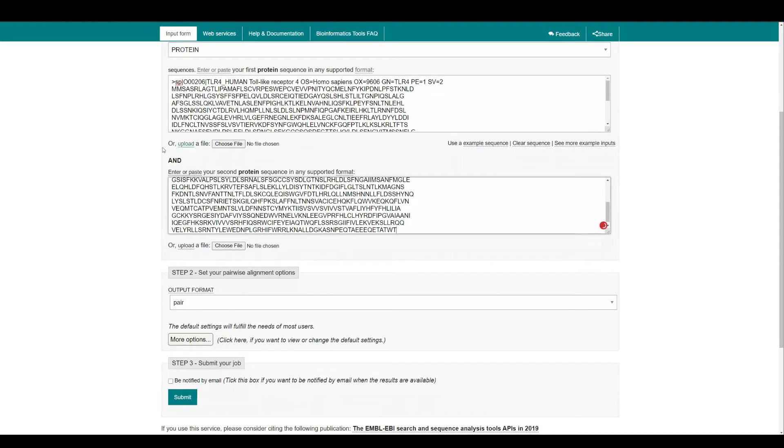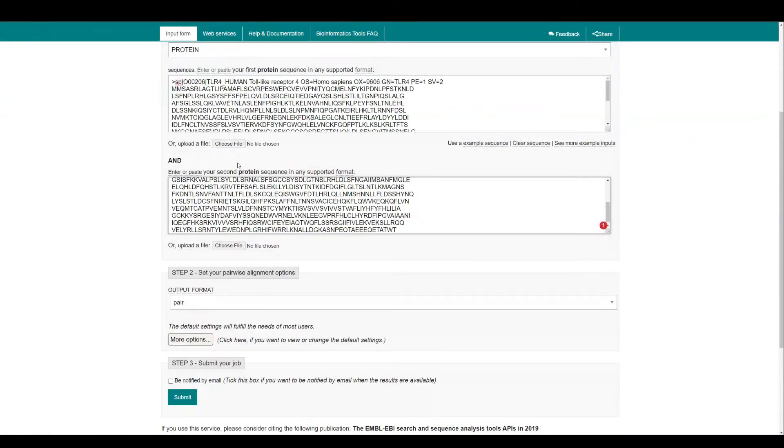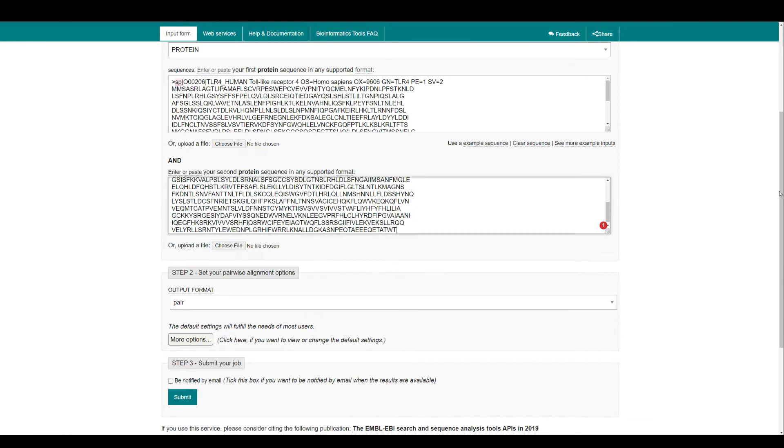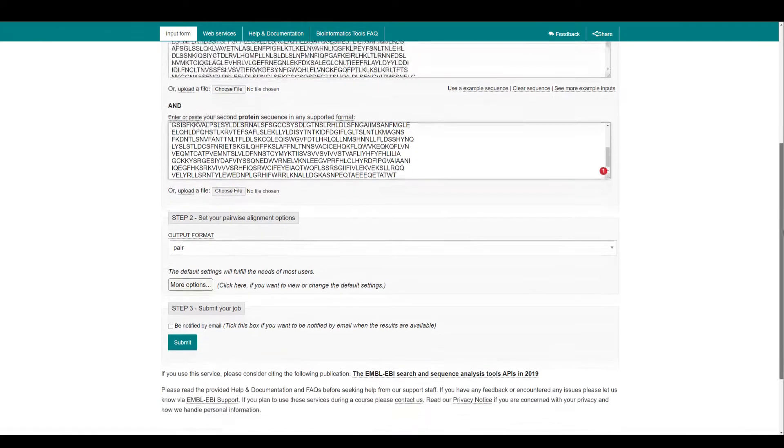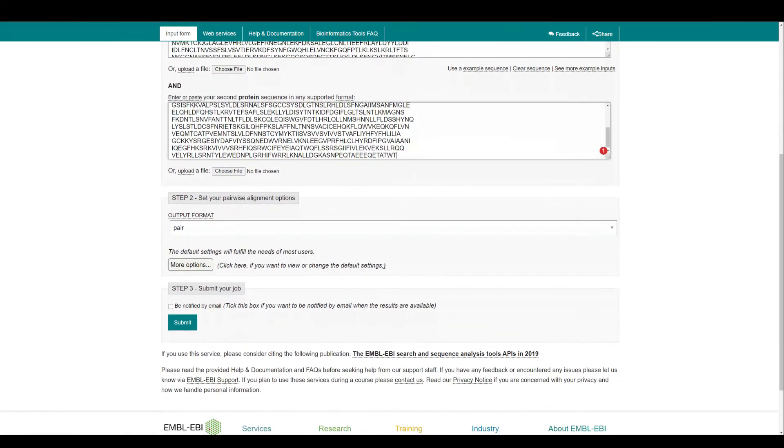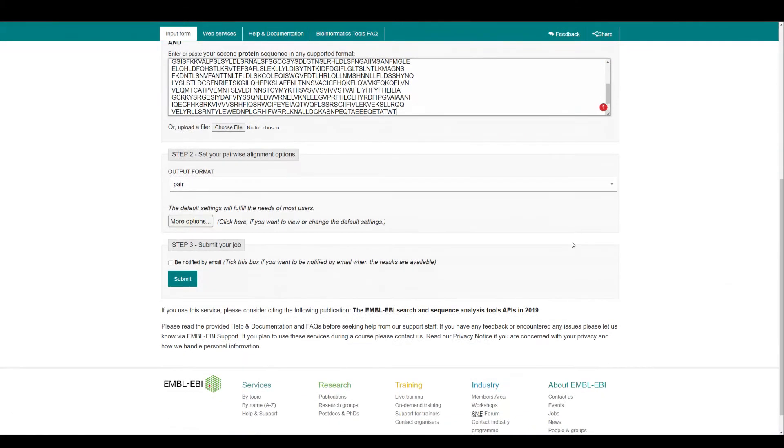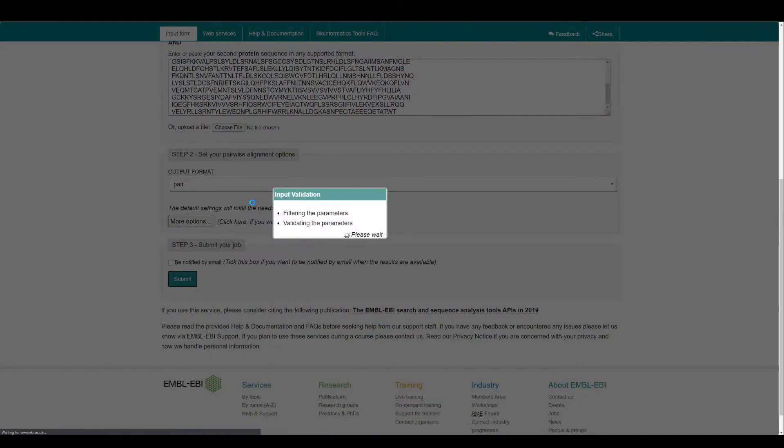You can also choose the selector, you can download this file and choose from this tab. You can also do what I've showed you. Now I'm going to use the default setting, but you can also change your settings. I'm just going to submit this.